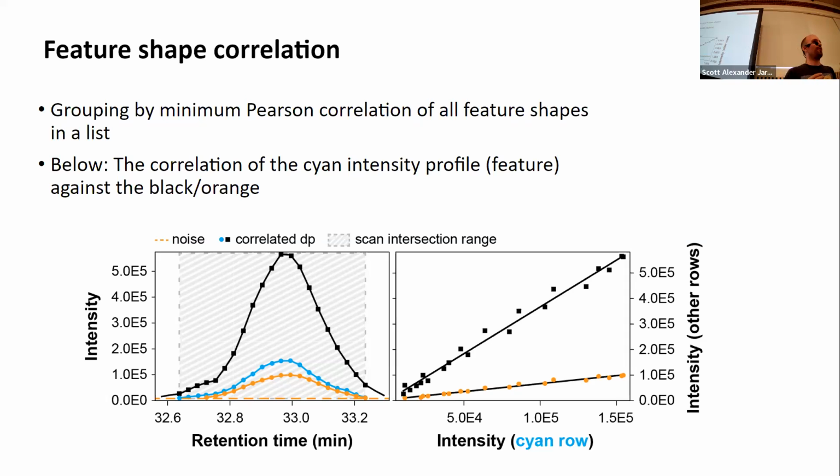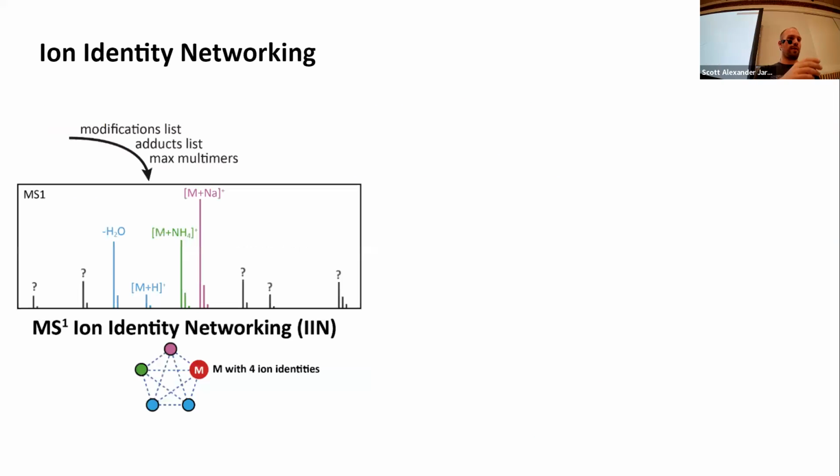I think Robin pointed it out very nicely: it adds confidence. Because if you see different adducts, and they all point to the same M, then you know, okay, this is a sodium adduct, and this is ammonium. And I'm pretty sure that this here must be M plus H plus, and thus this is the mass of M. If you only look at one, then sometimes, especially in the higher mass range, this is ambiguous.